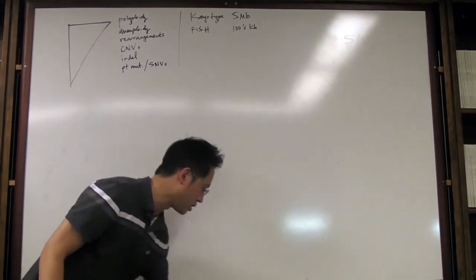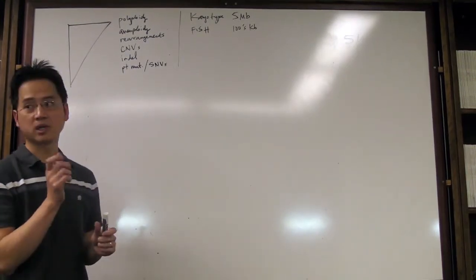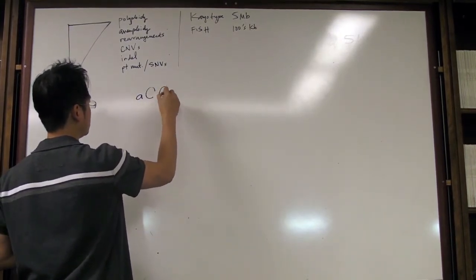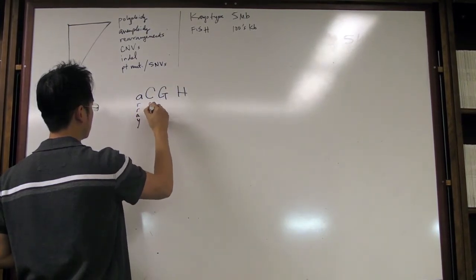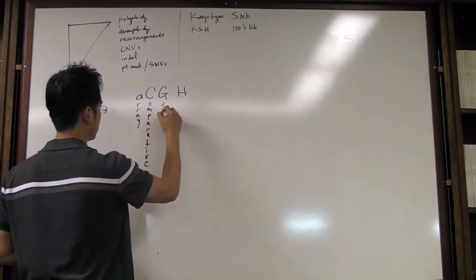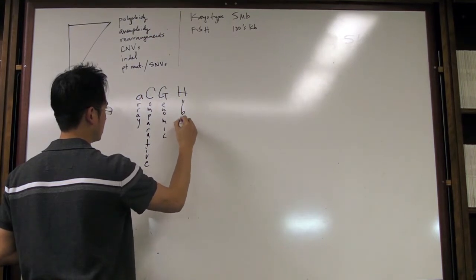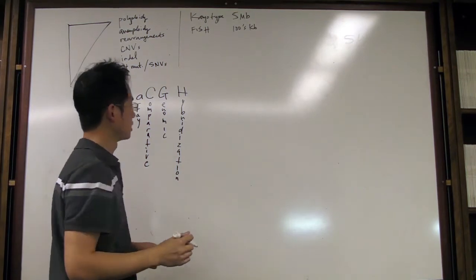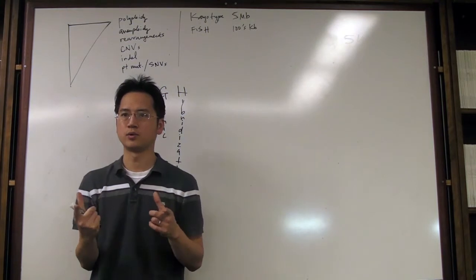So next I'm going to talk about array CGH, which kind of gets you back to the mode of karyotyping with some caveats. So array, comparative, genomic, hybridization. So this is John's claim to fame, his 2003 paper, which was one of two papers that came out.